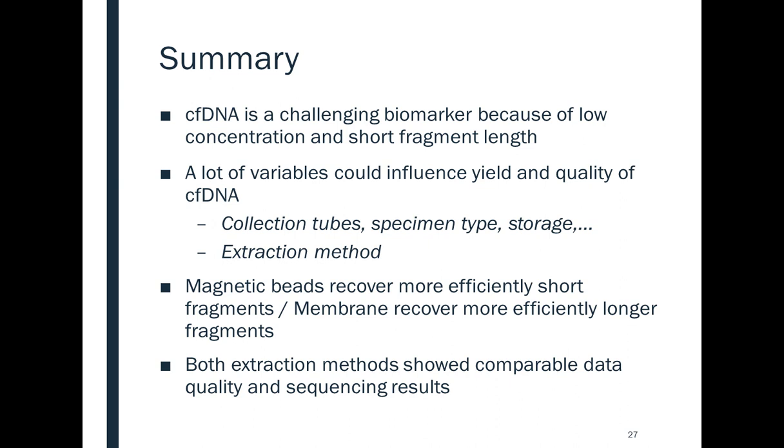Thank you. Now we have an attendee asking, I missed how much cfDNA was present in the Horizon controls. This is written in the Horizon Discovery information sheet. I'm not sure. I said maximum. I have to look it up. Sorry, or you will find it on the specification sheet for that HD817 sample.